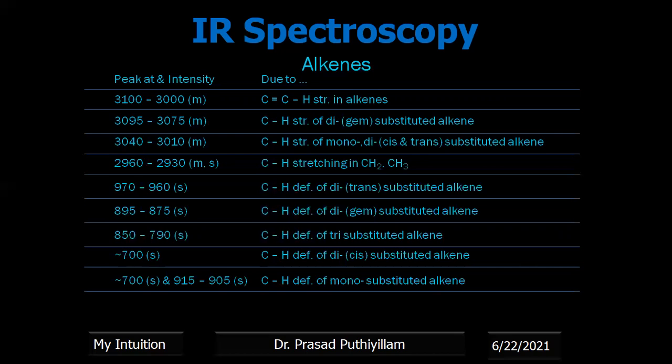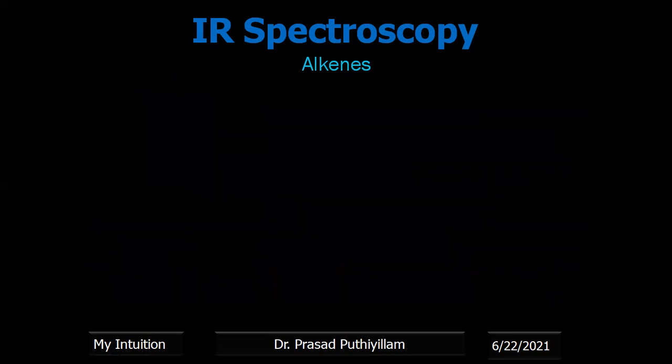All these are covered in a single table, the cis trans case, mono substituted, geminal case, everything is covered in a single table, so you can just separate them. For normal alkenes, what peaks should be obtained; if it is geminal type, what peaks are expected, you can separate from this table. If it is a cis type of alkene, then also the different peaks that are expected, we can split out and analyze.